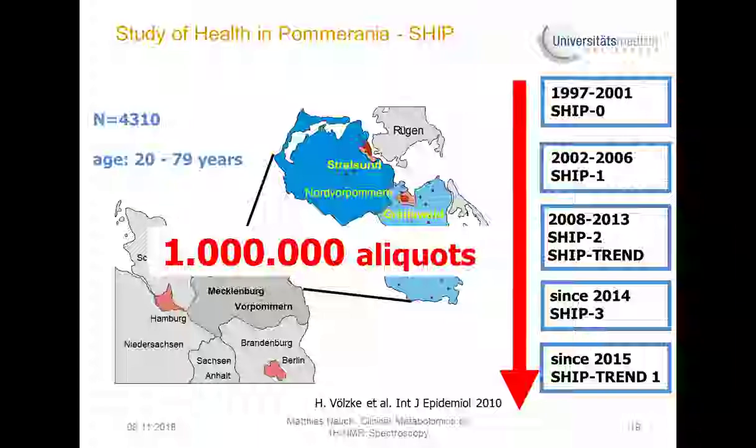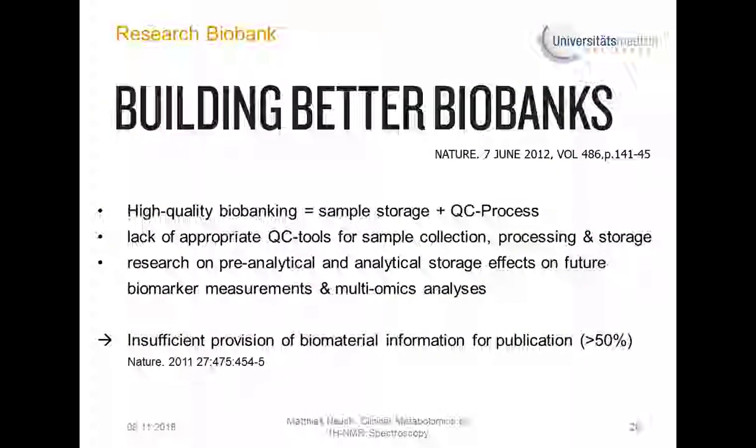And 10 years later we started with another study, SHIP Trend. And this study is very important for our knowledge, which we can detect with the NMR spectroscopy. Overall, we collected in the meantime about 1 million aliquots for our biobank. And the biobanking topic is quite important.